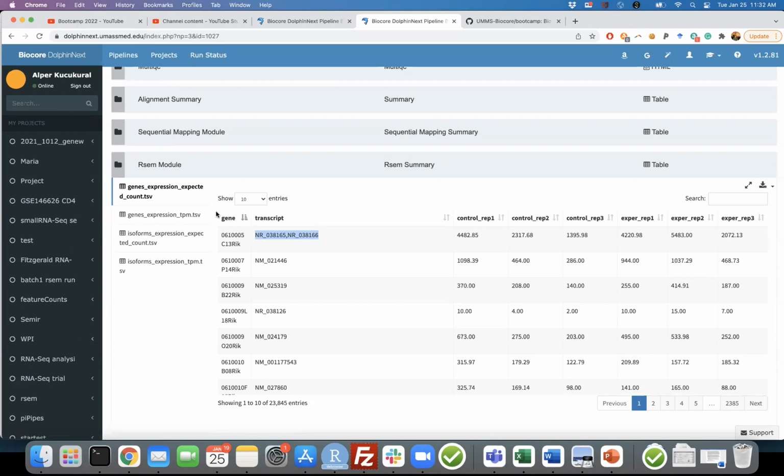When you see that, you can think of it as raw counts, because when you do your differential expression analysis, the counts should be raw, unnormalized counts, okay? If they're normalized, the statistical tests, by the way, Bruce is also a statistician, so he knows these things better, behind differential expression analysis use a distribution called negative binomial. So it requires raw counts.